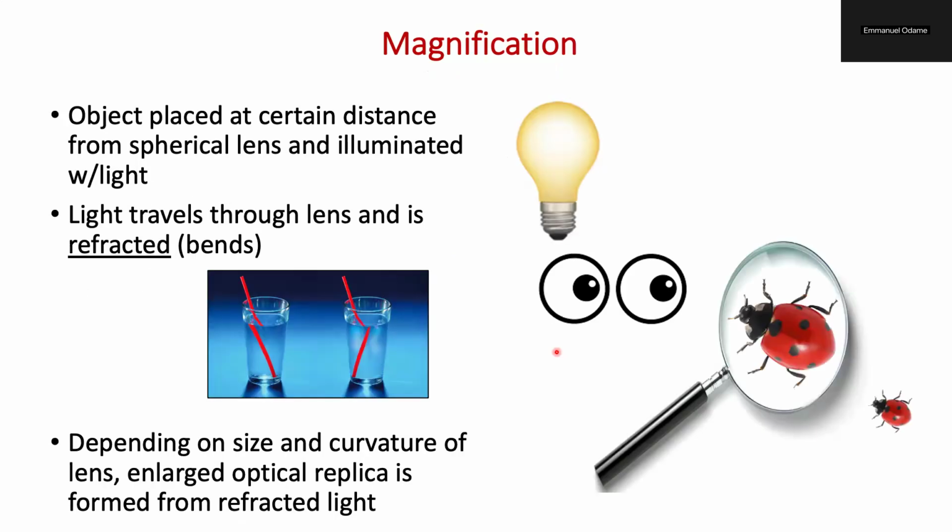So we first tackle magnification. Magnification occurs in two phases. You have an objective lens, which forms the raw image, and then you have an ocular lens that magnifies it into a virtual image. As you can see, we mostly put the object between the lens and the light source.